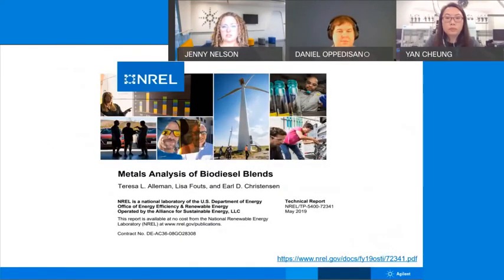And another exciting thing is Teresa and her group at NREL, they've recently published this technical report where they used our MPAES and this method that we developed with them. And they've published it on their NREL website. So if anybody's interested, they could go check out this technical report where they use this method to look at biodiesel blends, so in real life samples. So it was really good. Very interesting. I think that's very exciting news that all the more renewable research in our MPAES are able to participate in that.